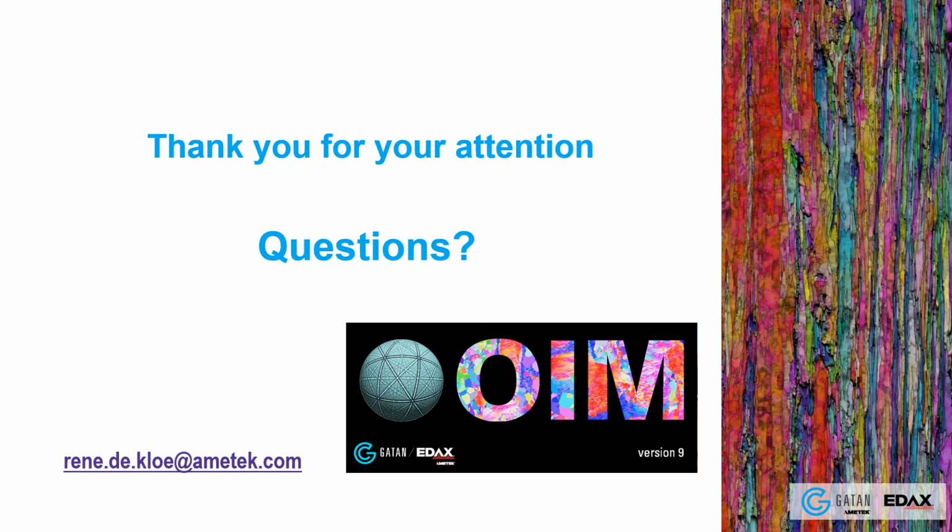So you can use the IQ. If you do that, make sure to use the grain average IQ. Otherwise, all your grain boundaries where you have overlapping patterns will be identified as martensite. So don't just use IQ, take the grain average. I often like to use some form of misorientation measurement in there. That is also quite a nice parameter to tell them apart.